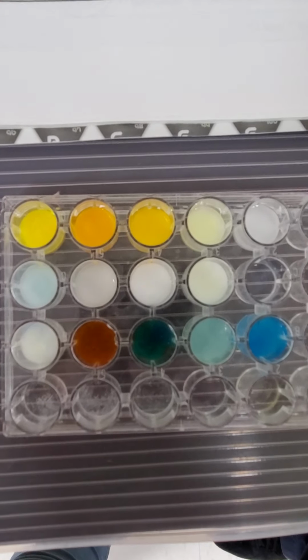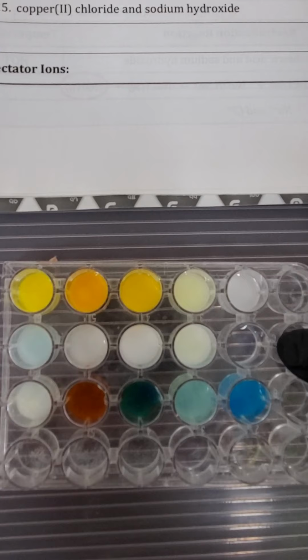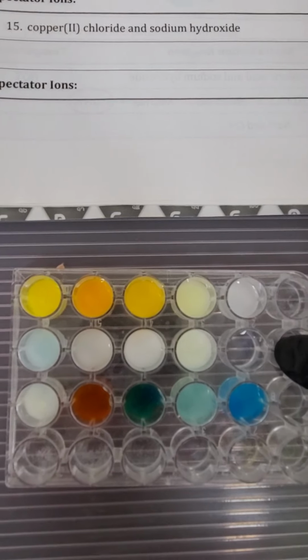So take a minute to record your observations. Looks like the only no reaction was this one from the previous page. Everybody else produced a precipitate, as hopefully your busy work has shown.